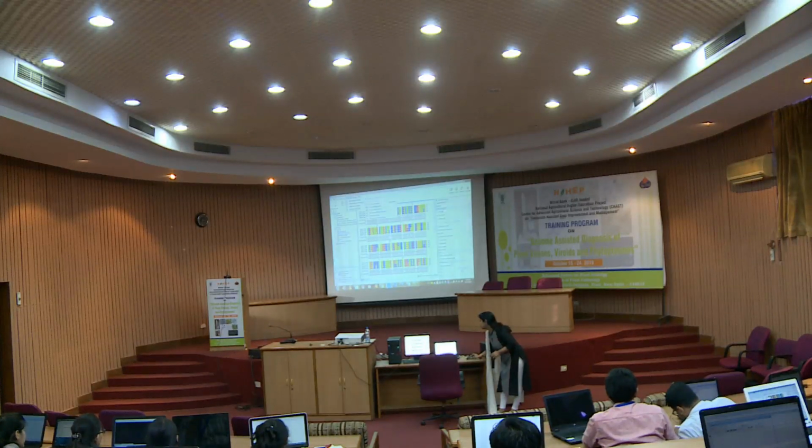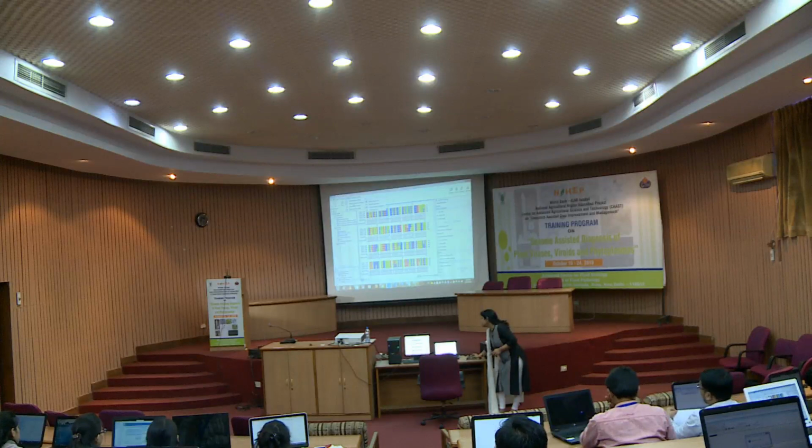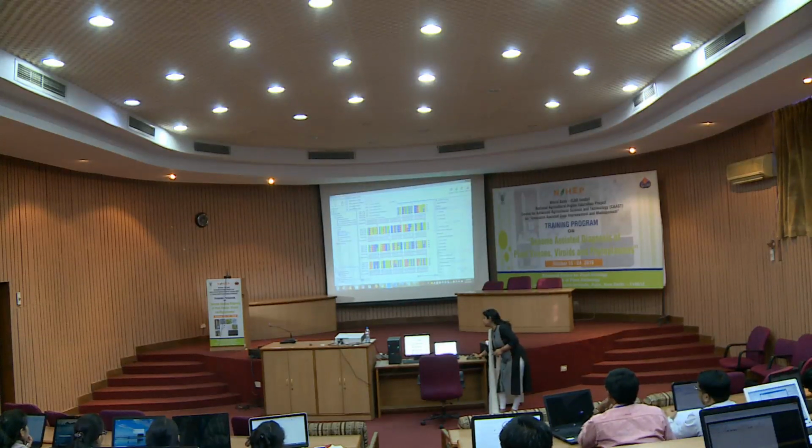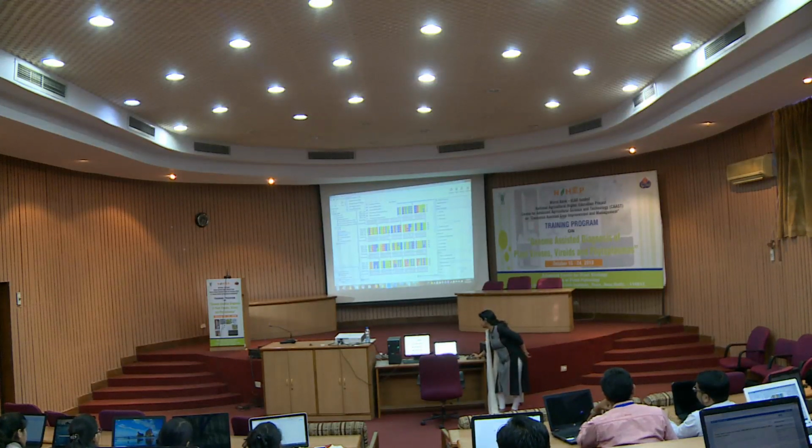You can do alignment, and you can also form phylogenetic trees with this. You can also join sequences and convert DNA to RNA or nucleotide to protein. There are several applications, and you can explore them later.